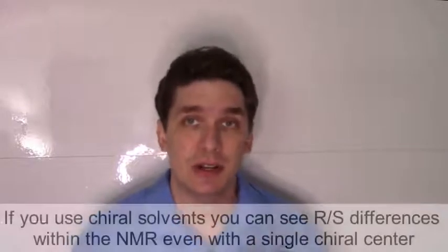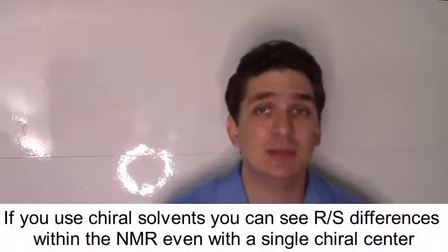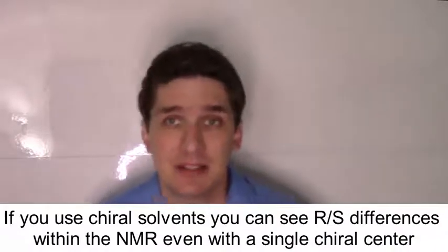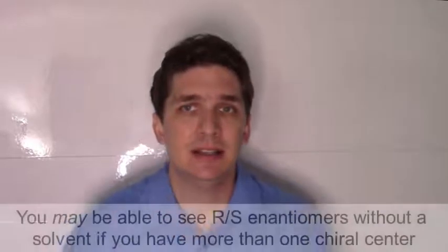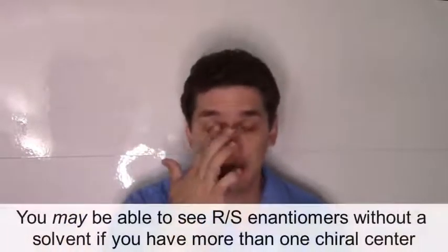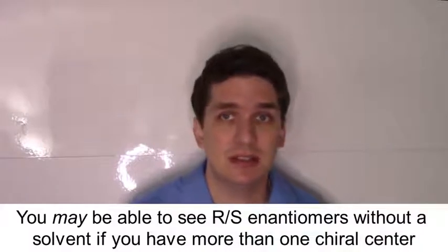But if you have a chiral solvent that you use to dissolve your molecule, in that case you can. Because the chiral solvent has an effect on the magnetic field, it will affect one conformation over the other. So this is actually a thriving field of research right now where people are trying to figure this out. If you have more than one chiral center, in principle you can do it without the chiral solvent. And again, this is as of the date I posted this, and this is what I'm able to find online, looking through people's published articles and theses and things like that.